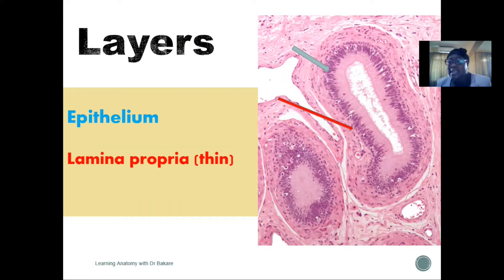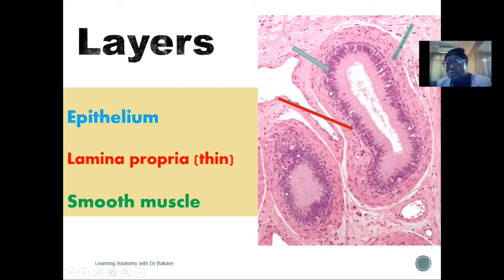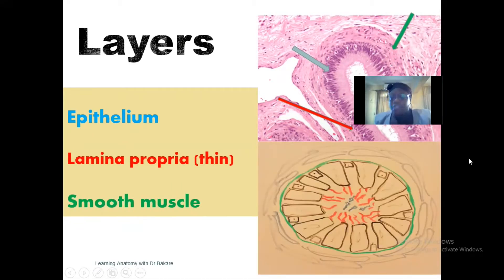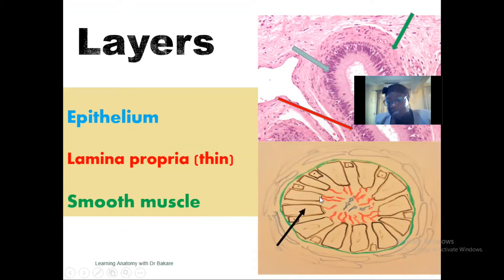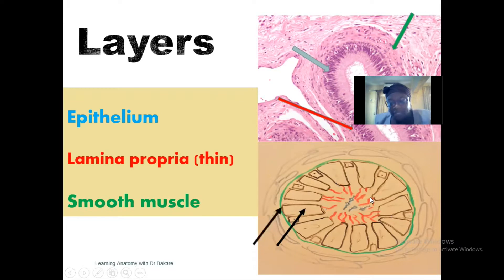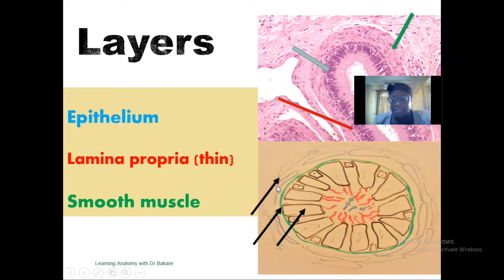More external, we have the smooth muscle layer — this is the smooth muscle layer on the outside. Looking through the handmade diagram below, we have the epithelium lining which forms contact with the lumen, this is the central lumen, and the lamina propria highlighted in green is seen lining below the epithelium. More externally, we have the smooth muscle layer on the outside.